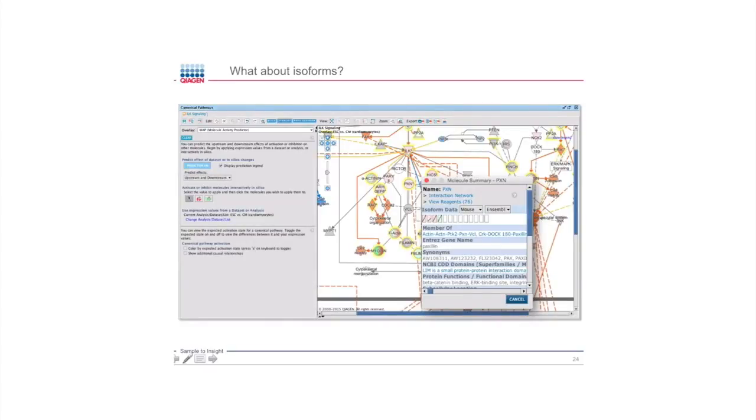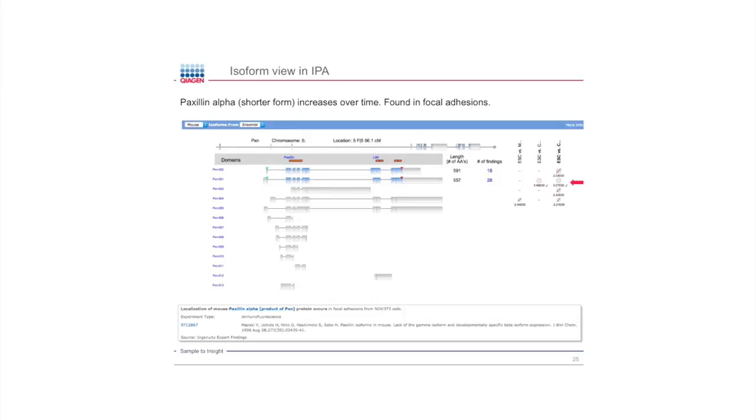And these little slashes mean that they didn't pass the expression cutoffs. So they were expressed, but they didn't pass my 3-fold change expression cutoff. And then there's a check mark, meaning one of them was chosen to represent the gene. So that color is what gives the Paxillin node its color, this isoform. But this is definitely a preview. You can't tell that much about it, although you can hover over these to see the name of the isoforms. It's better to click through and see the gene view itself.